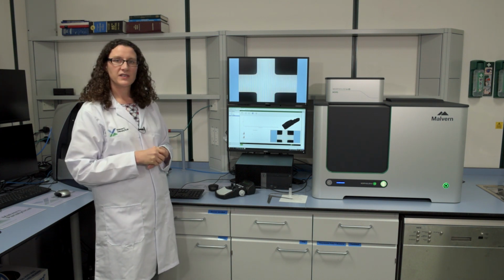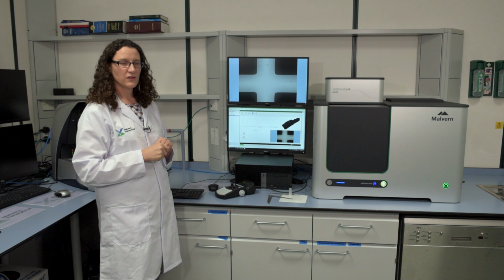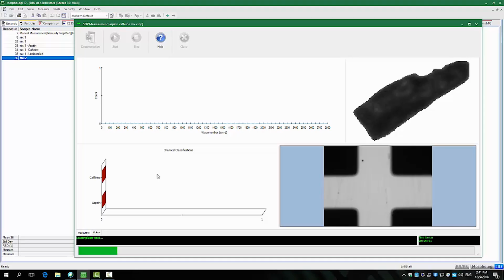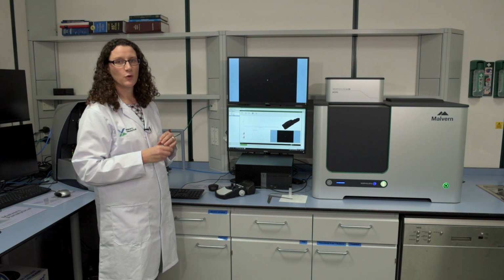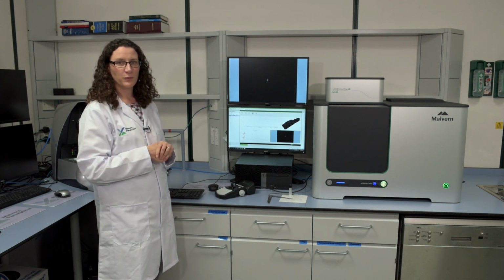It also needs to do some additional checks of the laser, for example. So in a minute, we're going to characterize the position of the laser, check the position of the spot, and check the focus of the laser relative to the focus optically, because these are all compensated for during the analysis. So here you might be able to see the laser spot. This is where it's characterizing the laser spot and checking its position. Again, this is very important because we go back to the XY coordinate of the particle that we've selected for identification. And we need to be sure when we get the Raman spectrum from it that we are in that correct position.